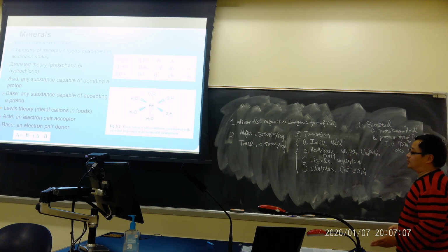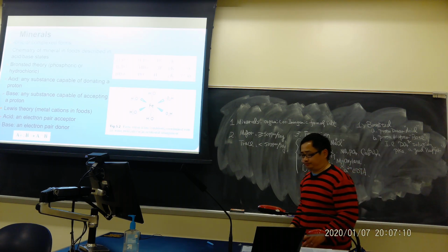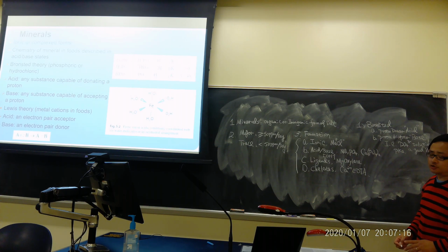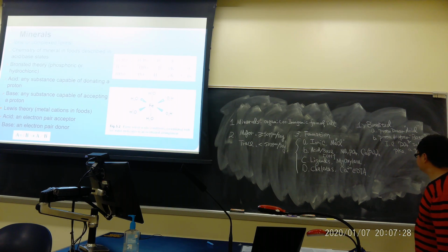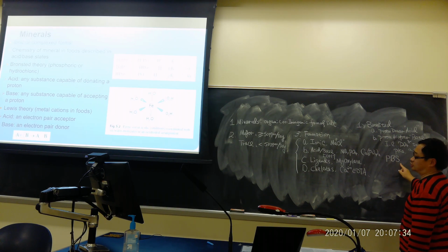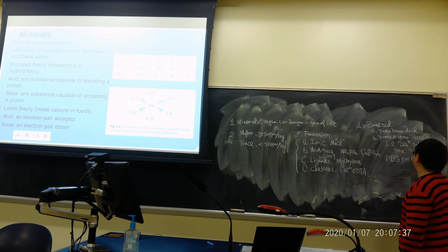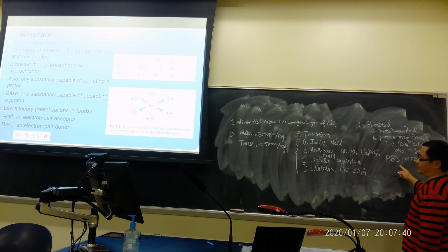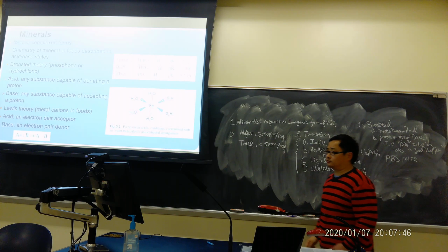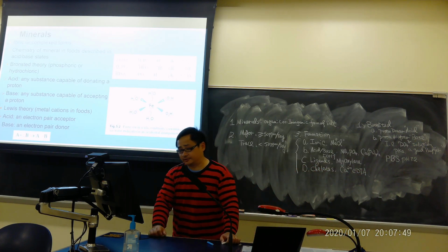So you know that we're not manufacturing foods in the lab, but when we cultivate bacteria, we sometimes use 0.9% saline solution, or 0.1% peptone water, or buffered peptone water. Sometimes we also use PBS, phosphate buffered solution, at pH 7.2. This is used to make sure the pH value of a bacterial solution is being buffered. So that's a good example for the phosphate.